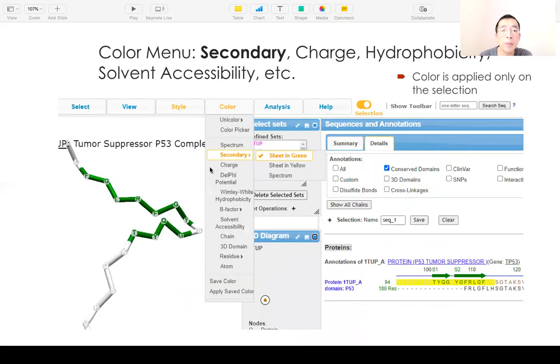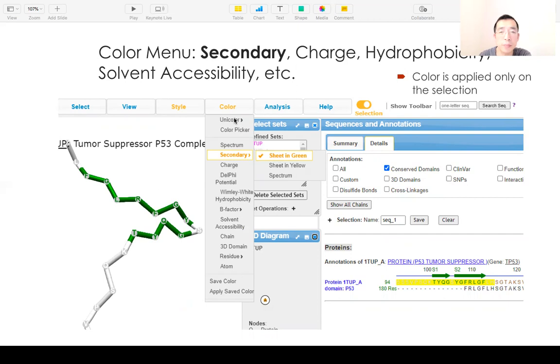In the color menu, there are different options. You can color by secondary structure, color by charge, by hydrophobicity, or apply a unique color to everything. The color will apply only to your selection. If you have no selection, it will apply to all items.